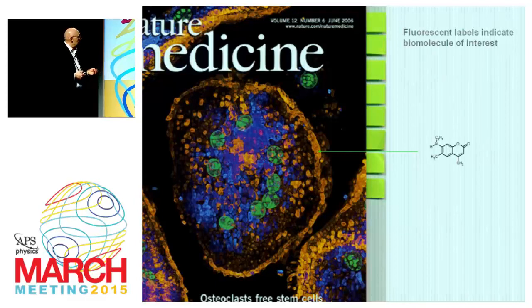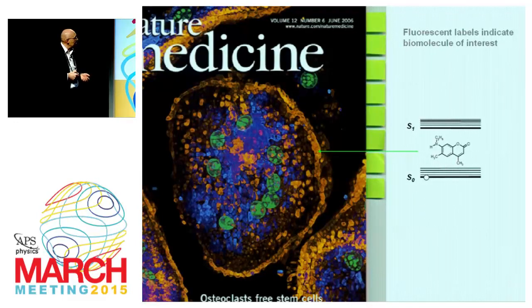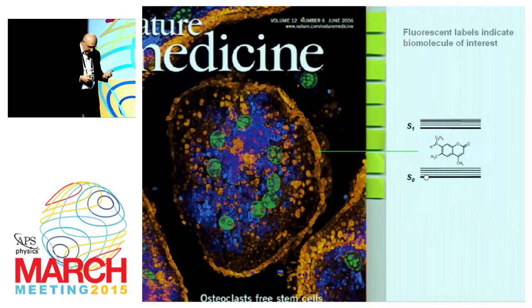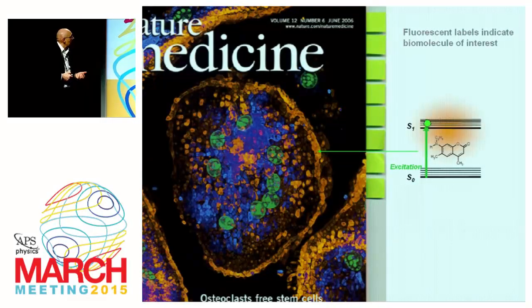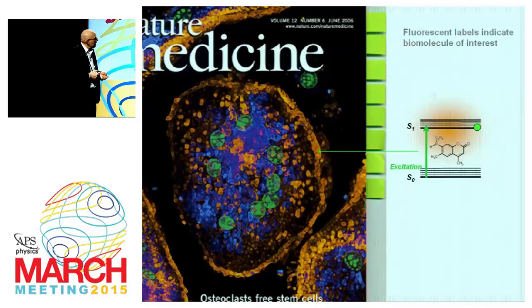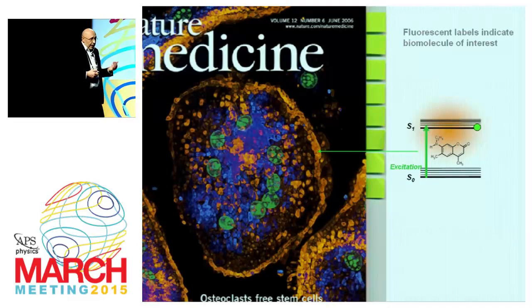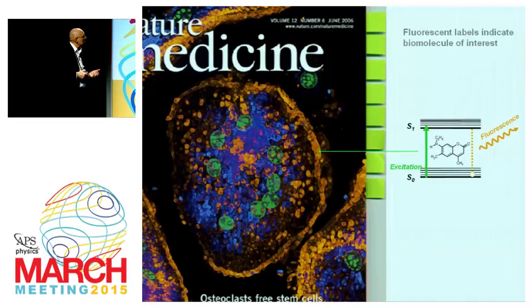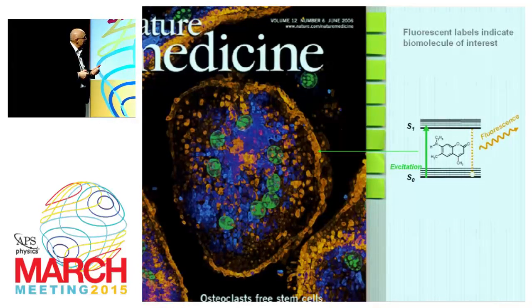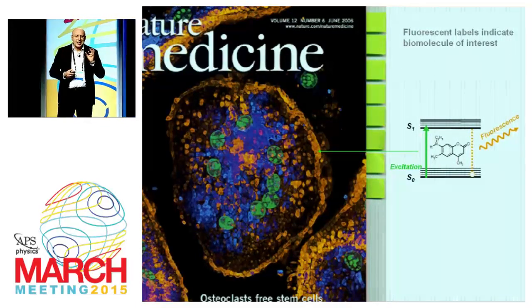Now, a fluorescent molecule has, as we all know, a basic energy state, a ground state with some vibrational substates, and a basic electronic excited state. And then if you shine light on it, for example, green light, then the molecule will be able to absorb a photon of suitable energy. Then it will end up in a higher vibrational state of the electronic excited state. And after some vibrational relaxation, it will end up in this state, which is the actual fluorescent state. And then, after about a nanosecond, the molecule comes down by emitting a fluorescent photon. Now, because some of the energy is lost in the vibrational decay, the fluorescent light is redshifted in wavelength, and that makes fluorescence microscopy extremely sensitive.